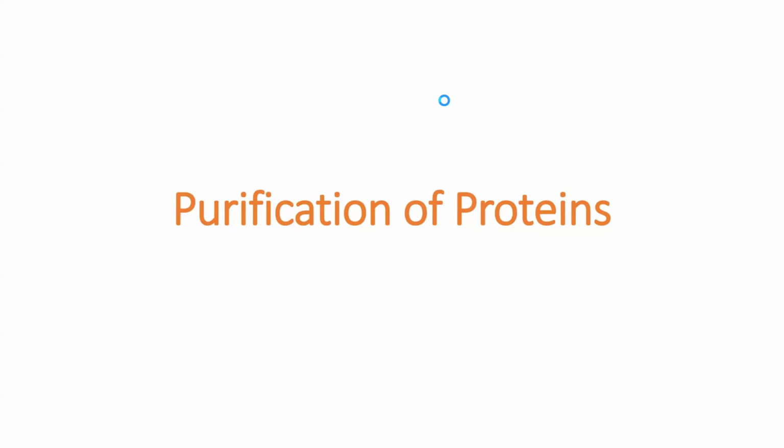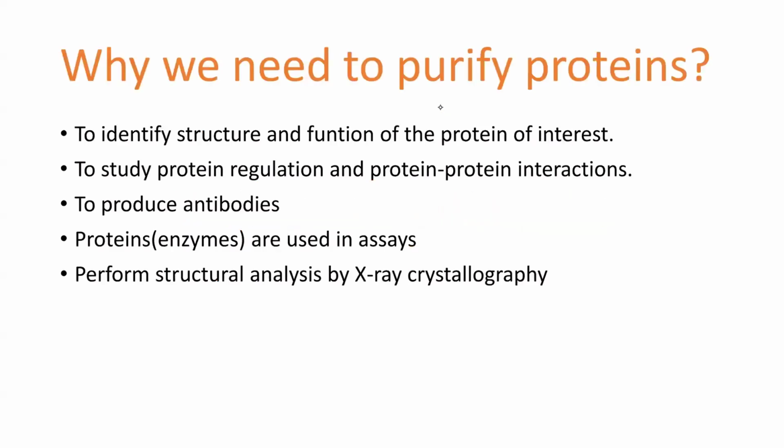And also in the case of proteins, if you want to study a particular protein, you have to isolate it. You have to extract it from the other proteins. So that is what we are going to look at in this lecture: how are we going to isolate the proteins from cocktails of proteins?